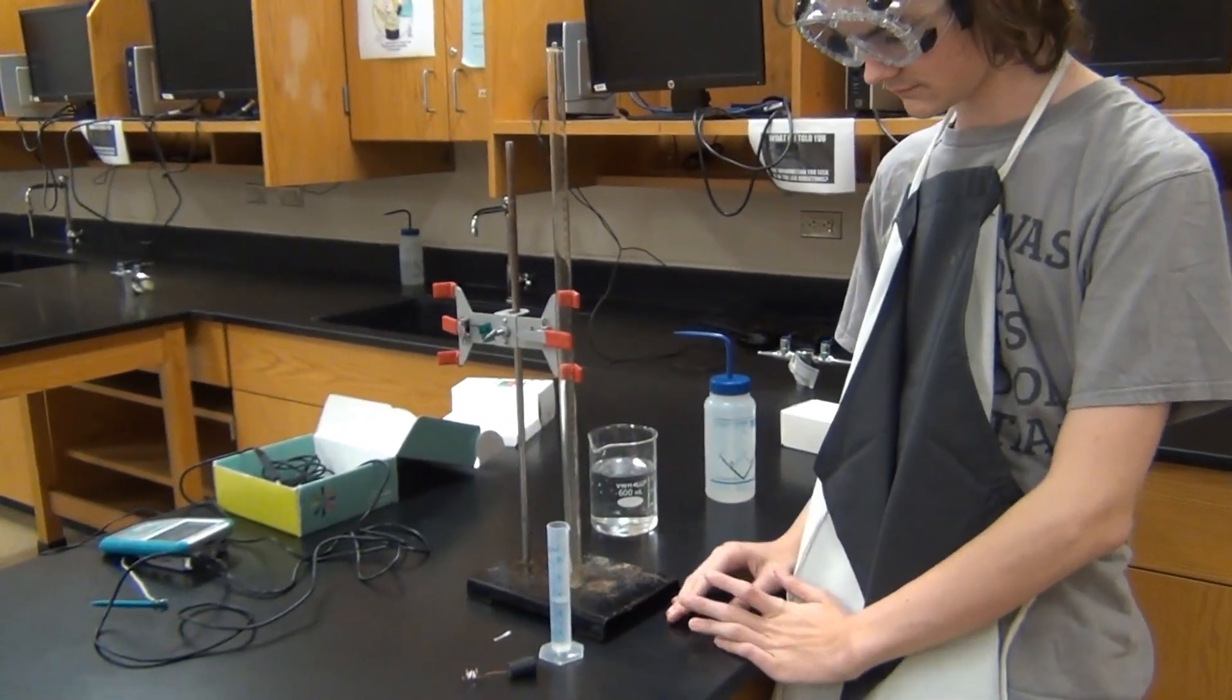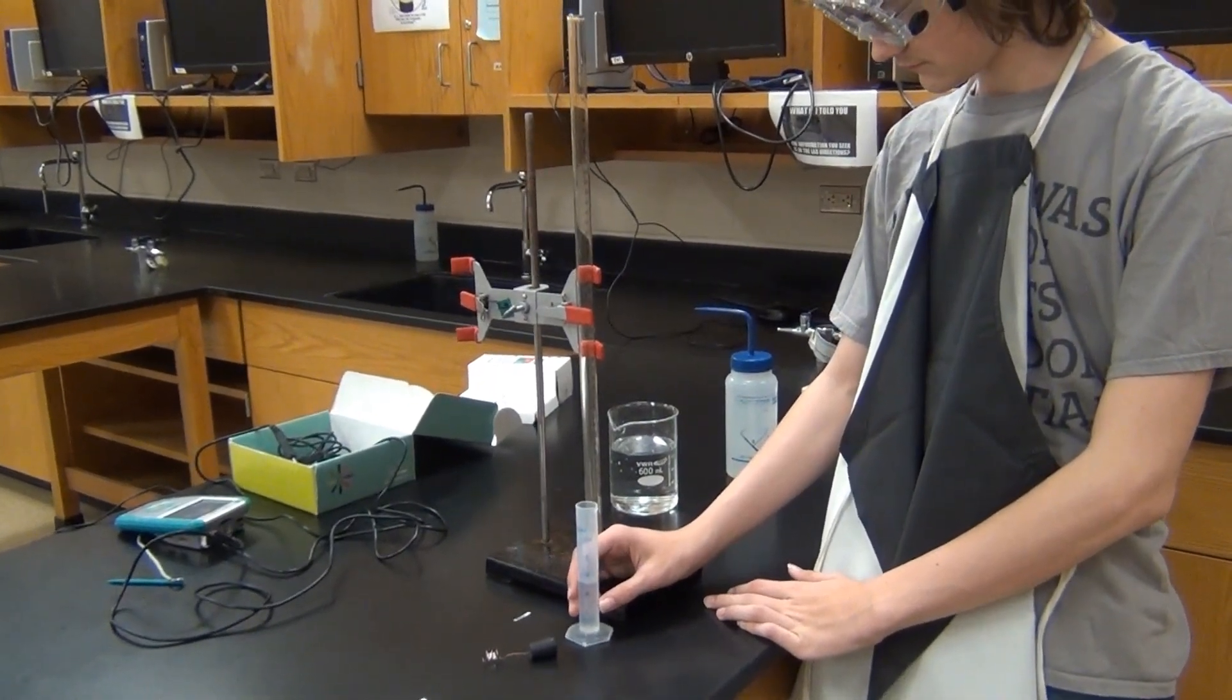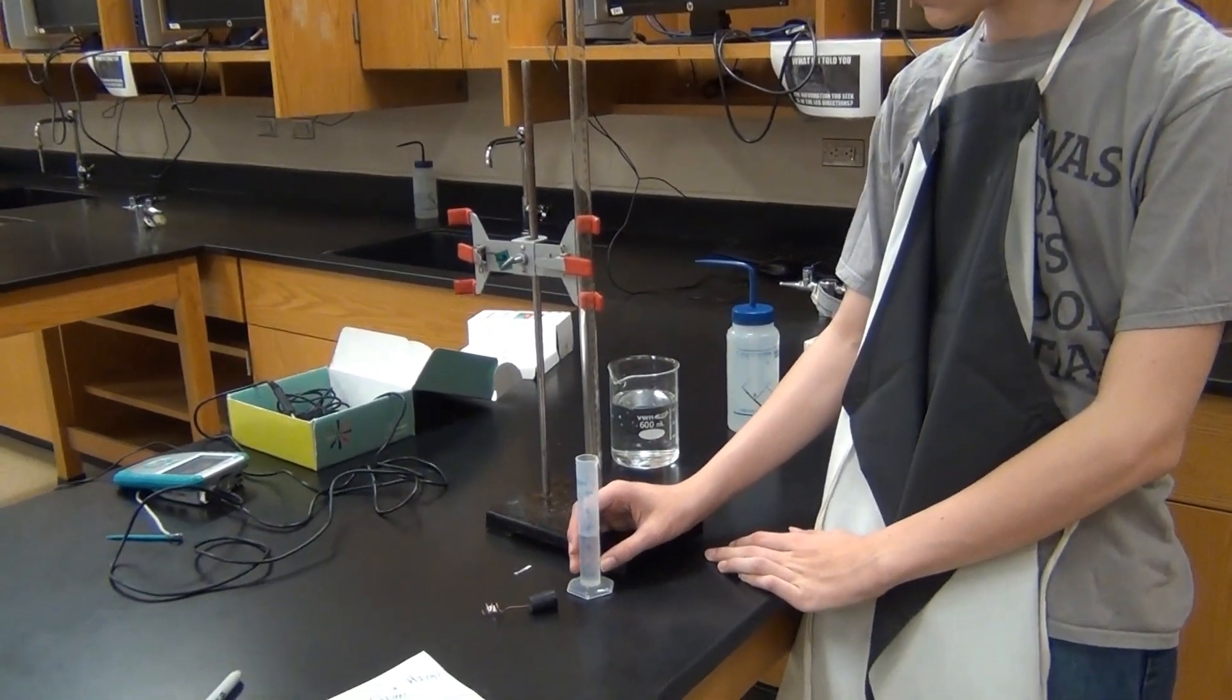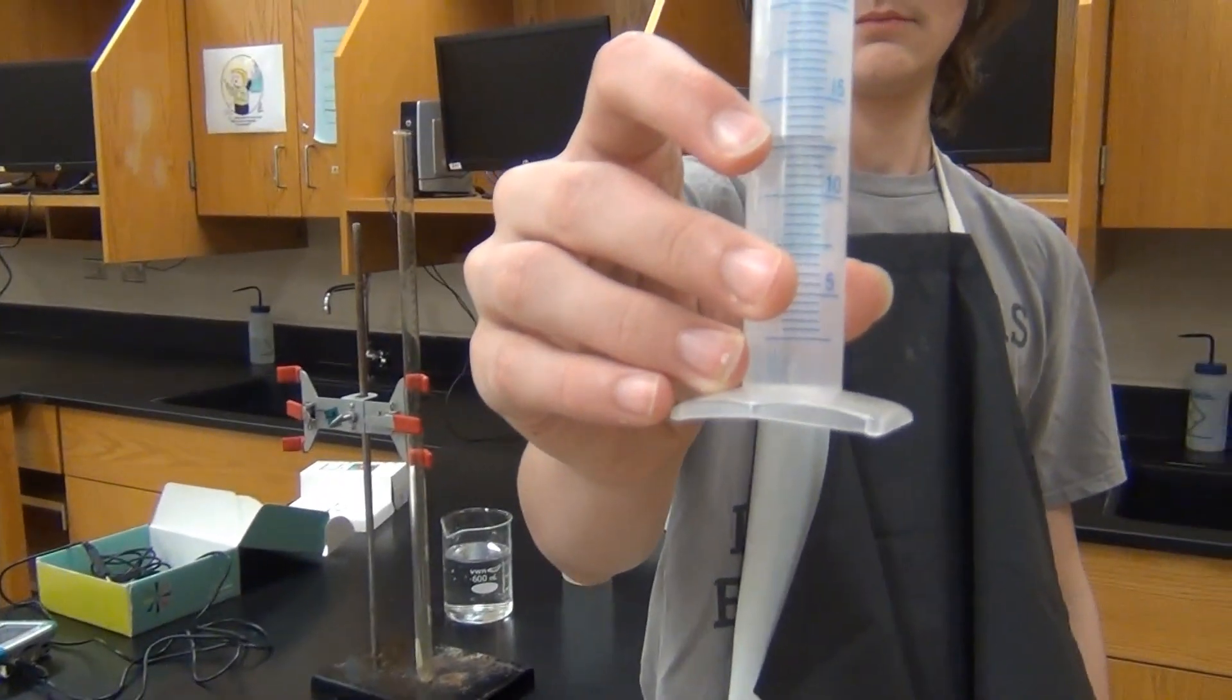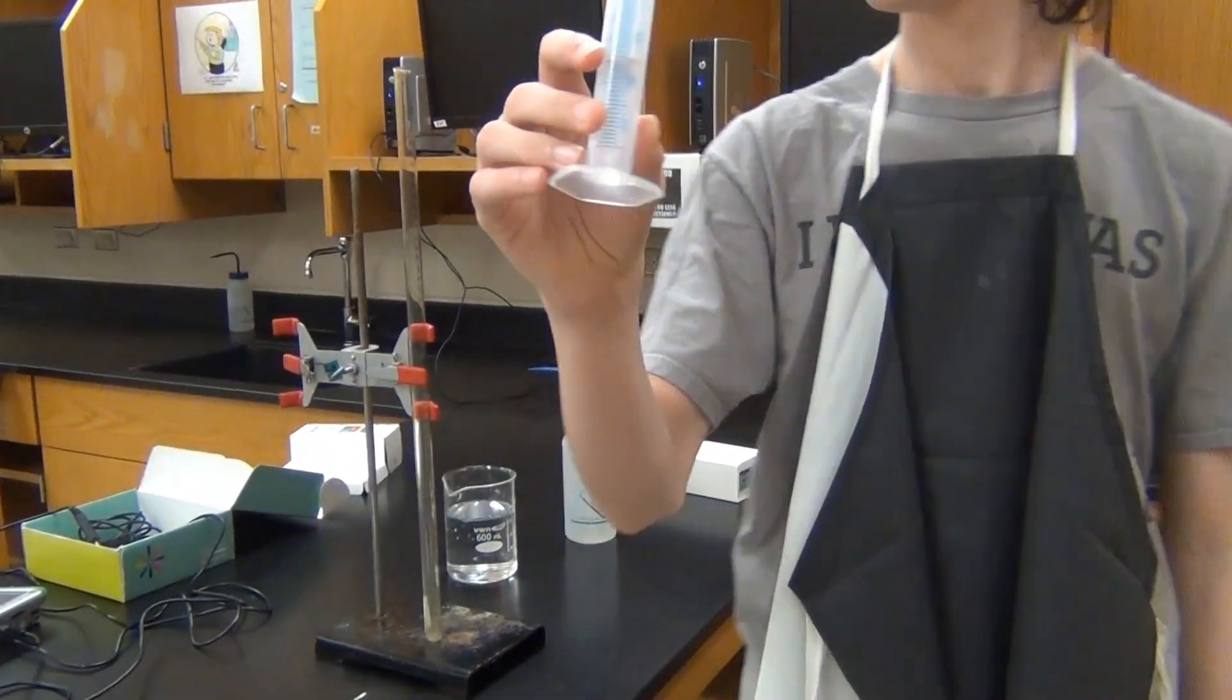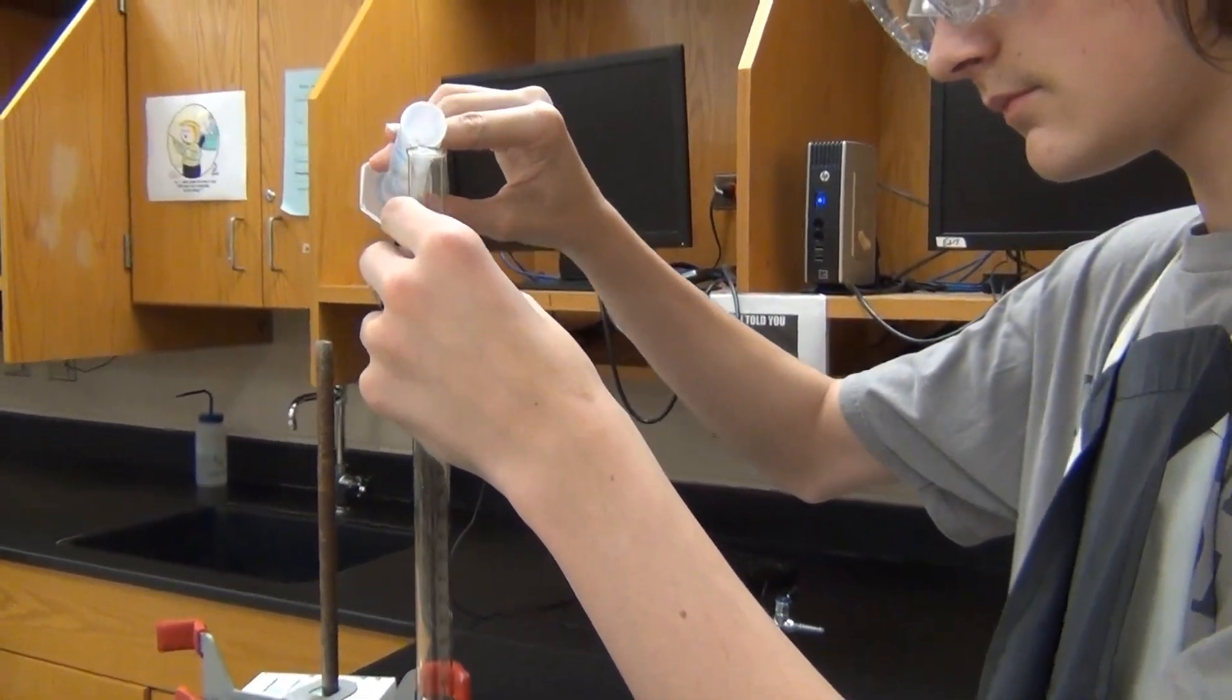So here's our setup. We have the eudiometer in a clamp so that it's standing upright right now. And we've measured out 12 milliliters of the hydrochloric acid in this graduated cylinder. And we're going to go ahead and pour that into the top of the tube carefully, watching out for fingers.